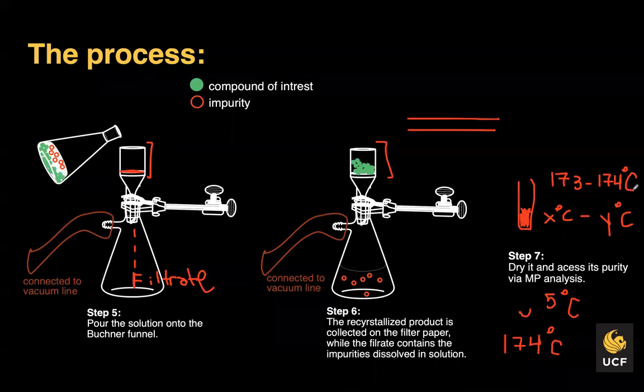If you run the melting point analysis, sometimes before and after recrystallization on a synthesis, you'll notice that it was more pure after recrystallization. How often is it used? It is a common technique for purifying a compound. It is one of the more common techniques. It's not suitable for every synthesis or for every experiment that's being done.